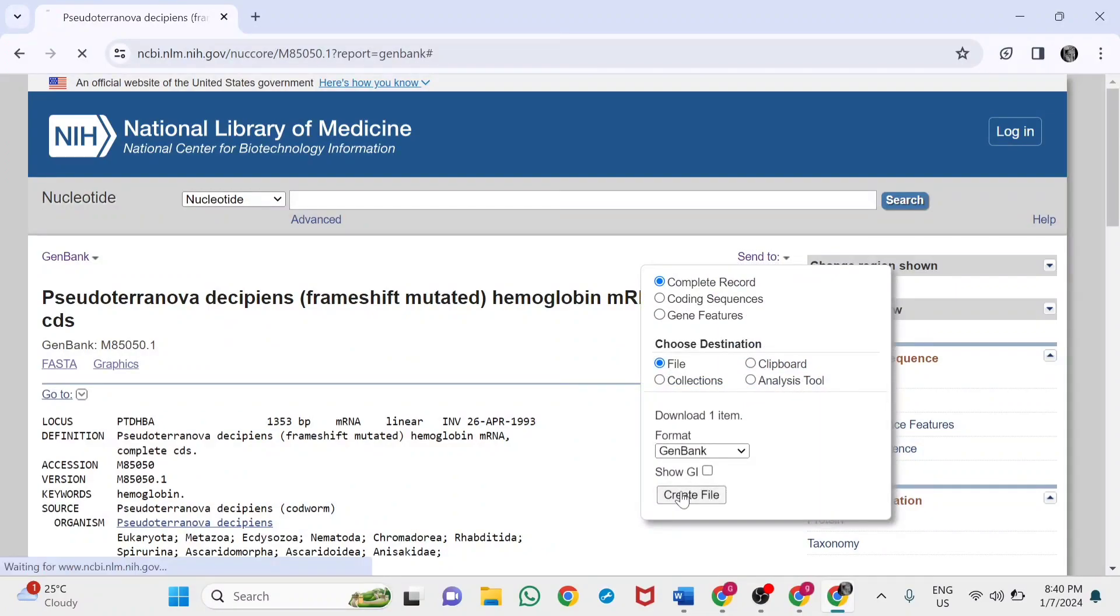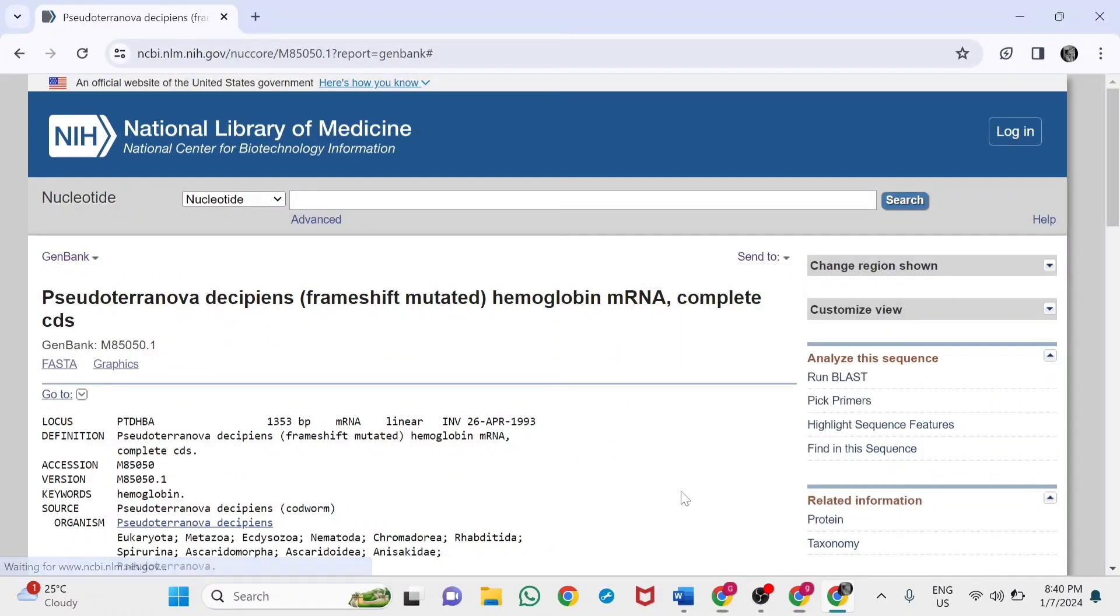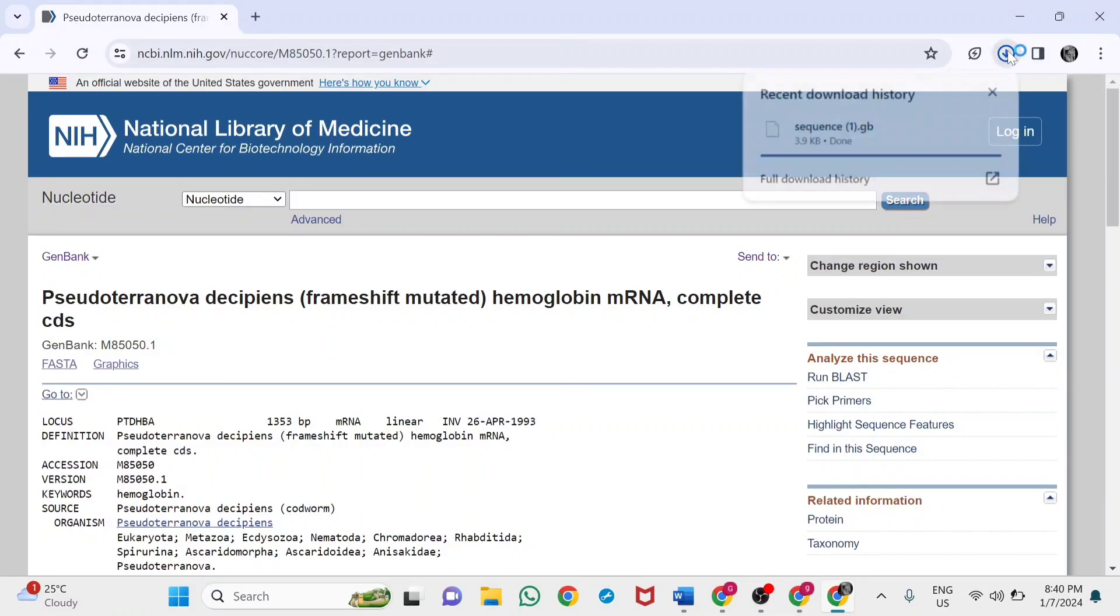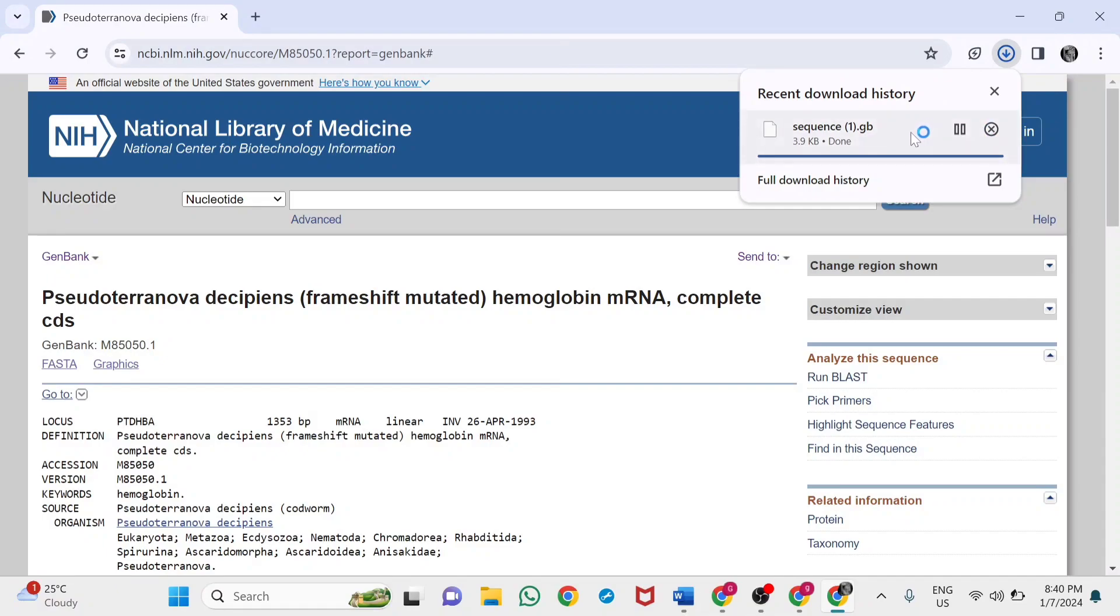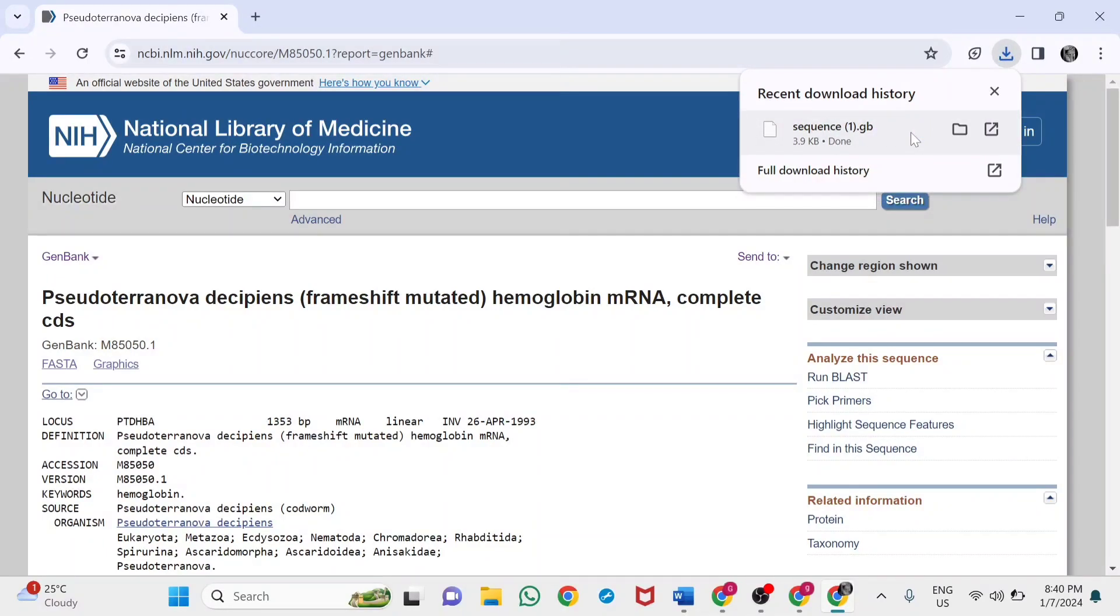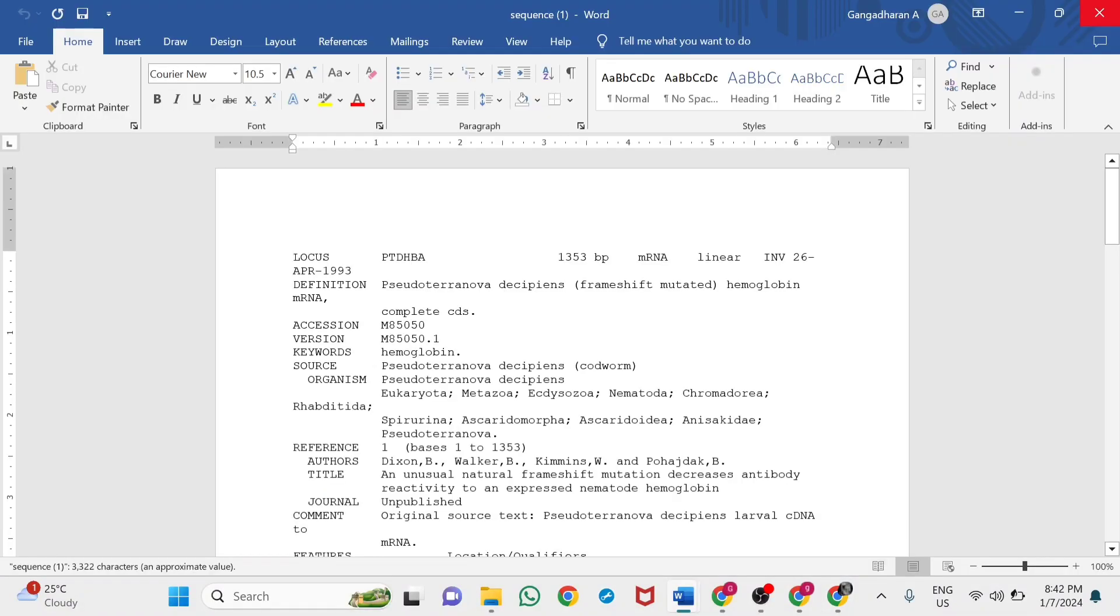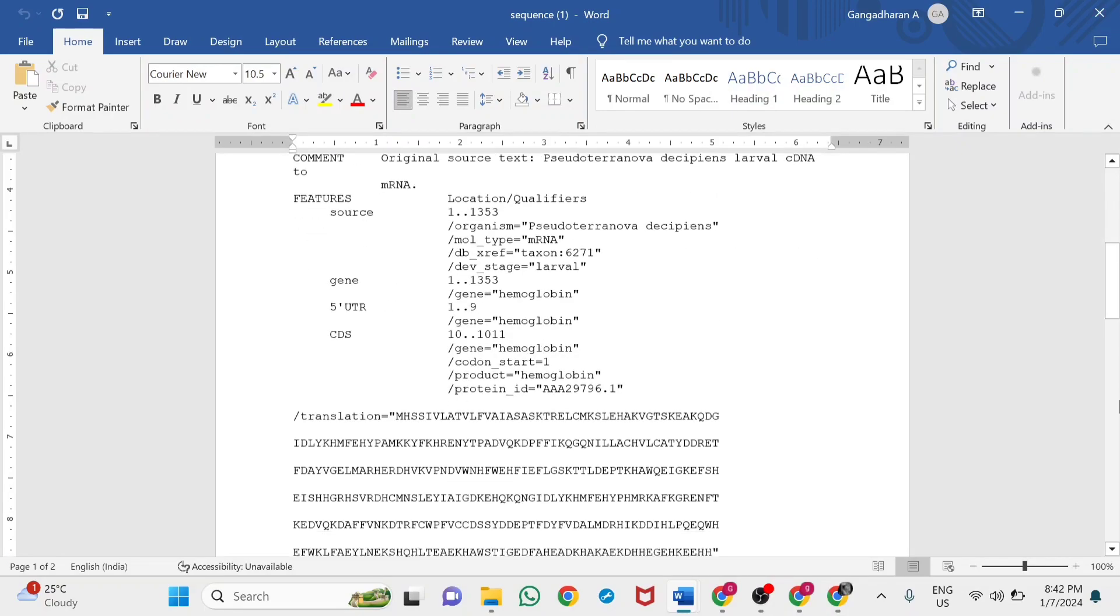Automatically, the file will be downloaded. You can visualize it in Microsoft Word. The sequence obtained from NCBI—the Pseudoterranova decipiens worm hemoglobin sequence—has been downloaded in GenBank format.